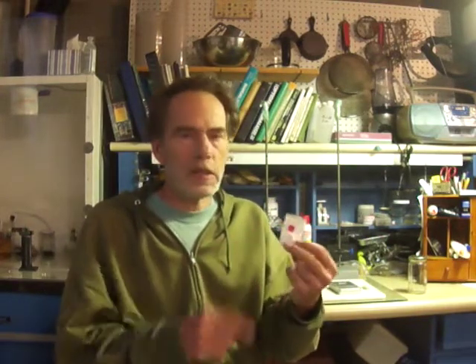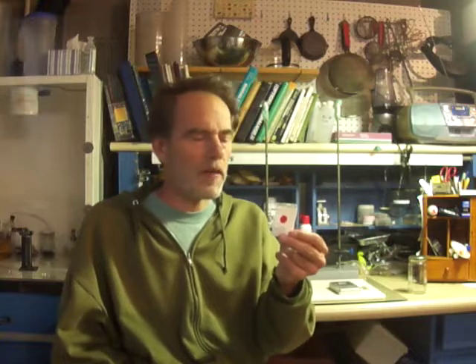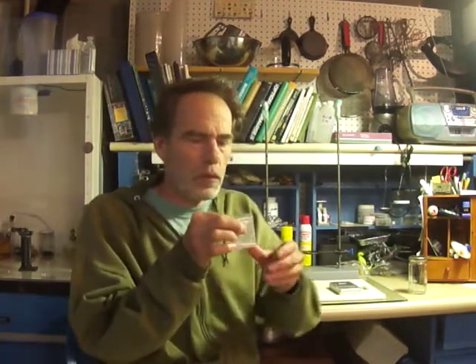And the second one, he said, was a mineral. The only information I have is that it has a specific gravity of 2.6, which is right in the mid-range of all the silicates, so I don't know if that's a lot of information. But he did say the hardness was 2, so that's pretty soft. But still, not enough for me to narrow down any testing protocol, so I'll have to go through pretty much the whole procedure here.